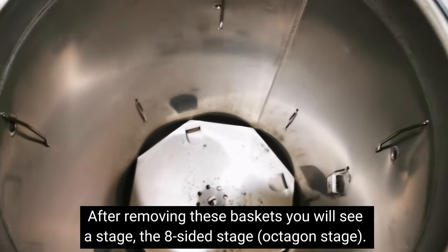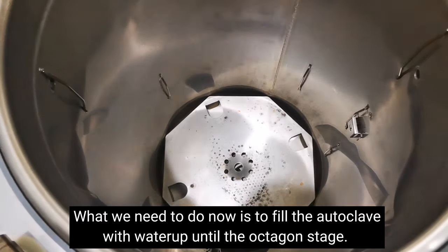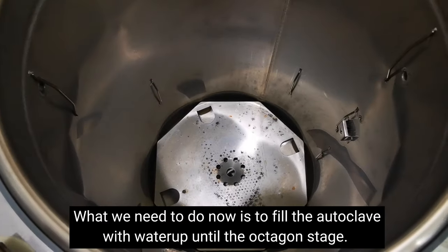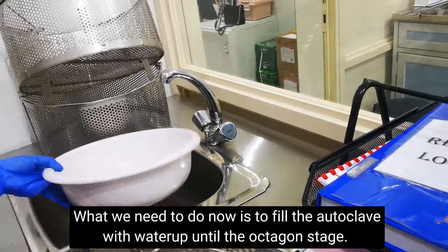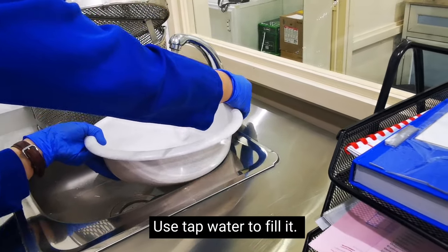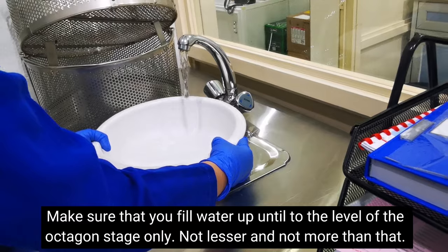As you can see, the inside of the autoclave has a stage — what we need to do is fill water up to the level of that stage. It has an octagonal shape. We'll fill it with tap water only, and make sure the water level is the same as the stage level — don't overfill.